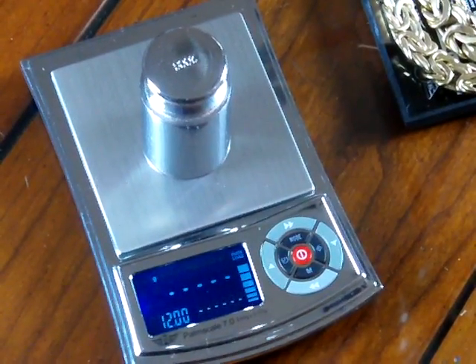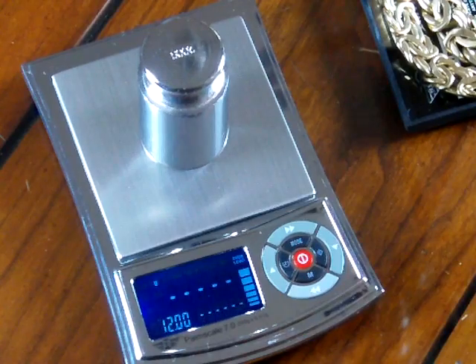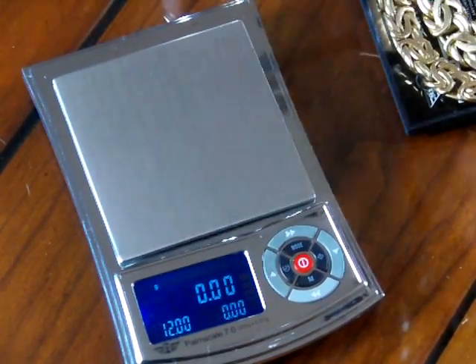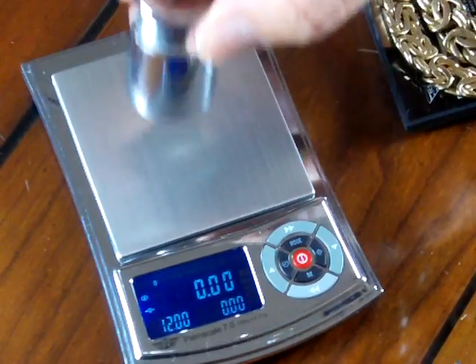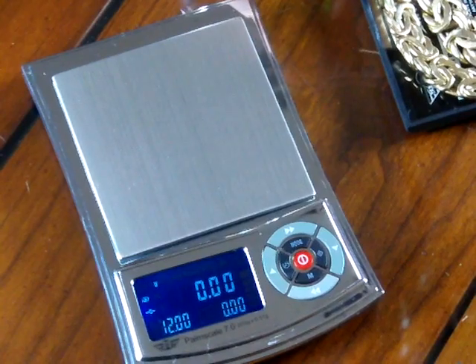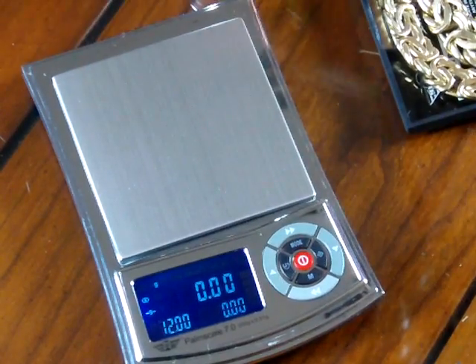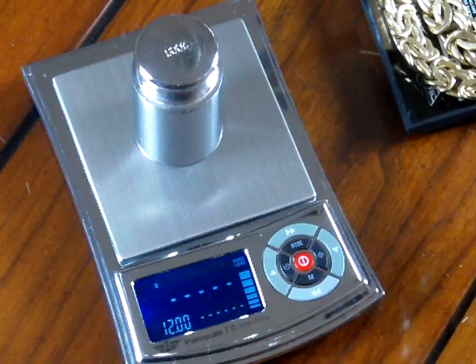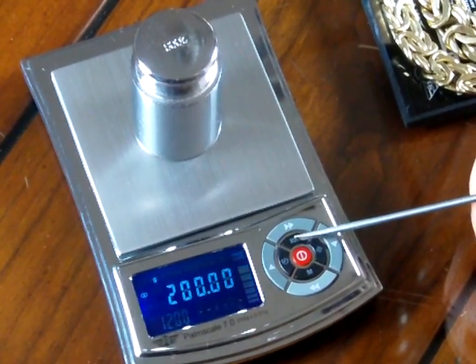To calibrate the scale you need the 200 gram weight that comes with it. Let's put on the 200 gram weight and see where the scale is — it says overload. This is a 200 gram weight and it's saying there's too much weight, which tells me the scale needs to be calibrated. To perform calibration: make sure nothing else is on the platform, press the tear button so it's at zero, put on your 200 grams, then press and hold the mode button. You'll see 200 flash, and then it says 'pass' — calibration is complete. Now we have 200 grams reading correctly.